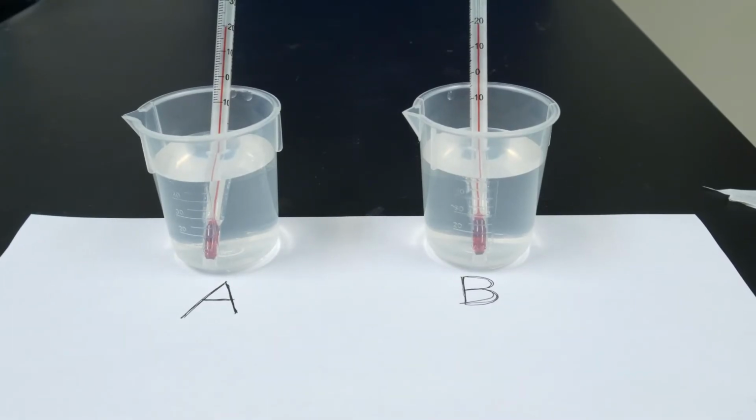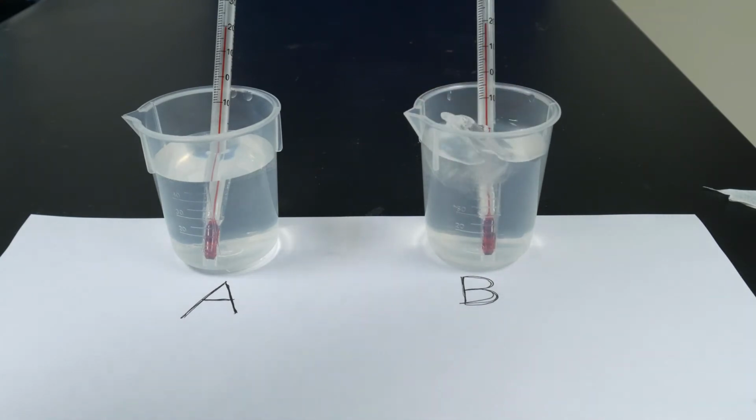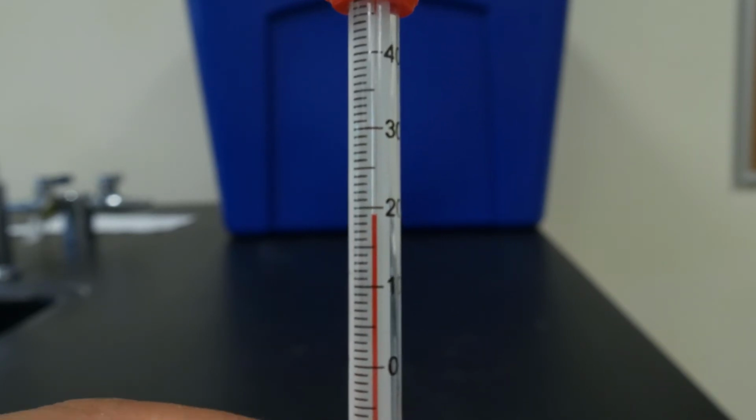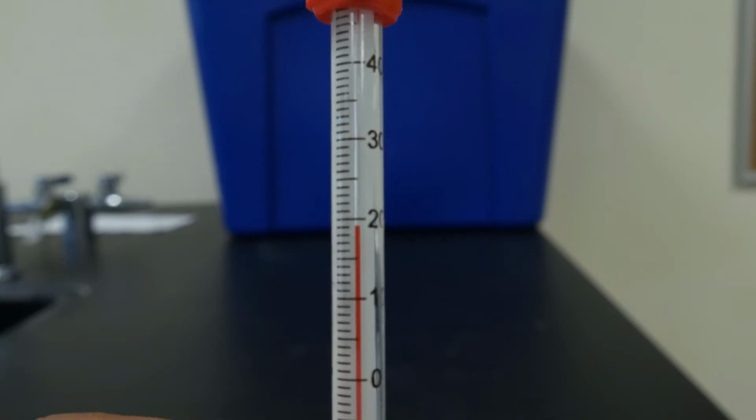All right, so now we're going to add an ice cube to beaker B. So I have an ice cube here. We're going to add this in. And after a minute, we're going to check the temperature of beaker B and compare to A. And then after 5 minutes, we are going to check the temperature again, and then we'll look at the volumes. So here we go. Looking at our thermometer for beaker A, after 1 minute, it looks like the temperature is still at about 19 degrees Celsius.